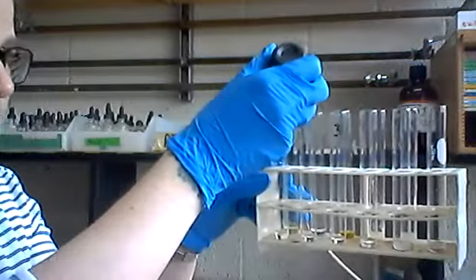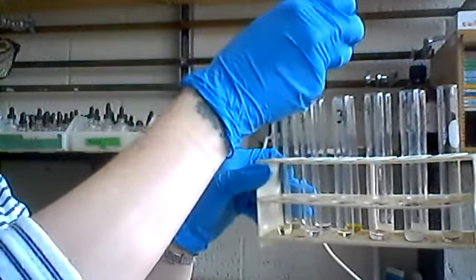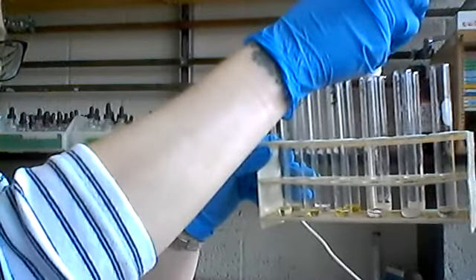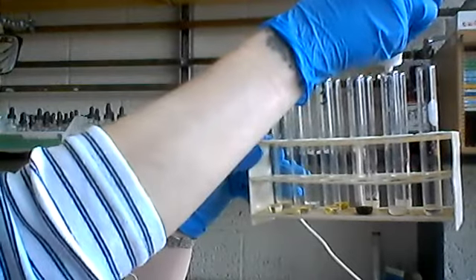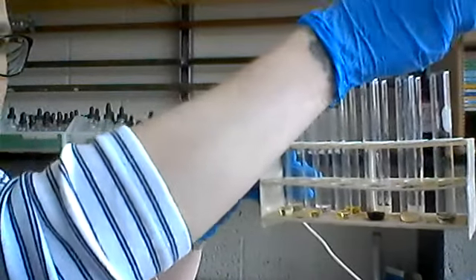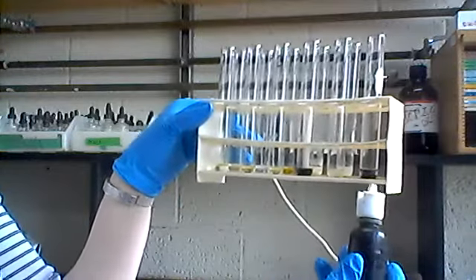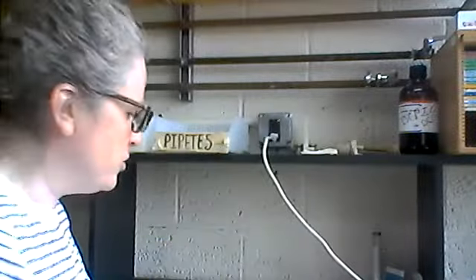And this change happens pretty much immediately in the things where you see a reaction. So it is that kind of brownish yellowish color. So you'll see that, and you can see almost as soon as it hits, Number 4 is starch. And you saw as soon as it hit, it had that really pronounced change to bluish black. Looks like number 6 is too, which is our mashed potatoes, which makes sense.